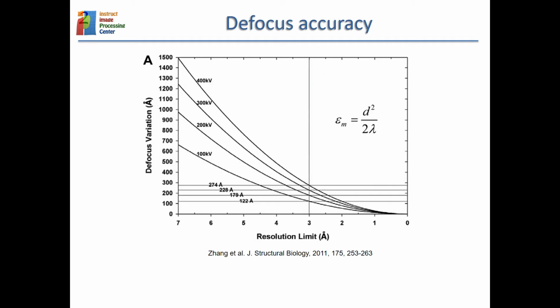And here is a theoretical paper where they analyze what could be the factors that could limit the resolution of high resolution structures in cryoEM.